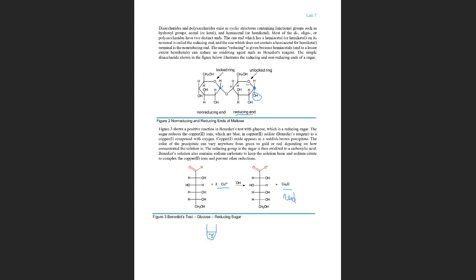And if you look at the oxidation state of this compound, you will see that copper is copper +1. And here it was copper +2. That means the oxidation state of the copper went from 2 to 1. Copper is reduced, and this changed the color from blue. We add a blue solution, and it turns red.